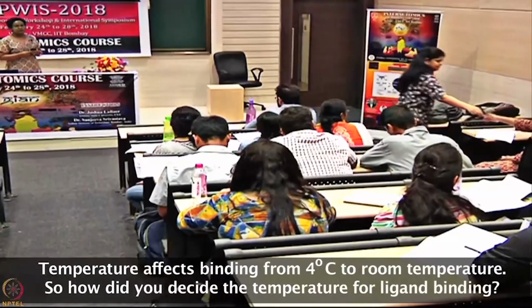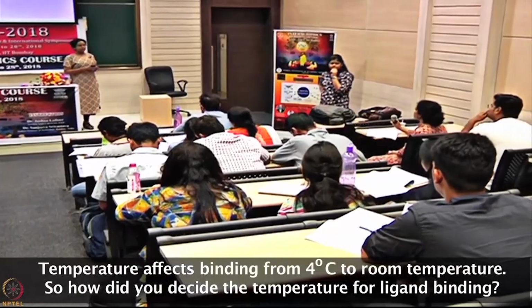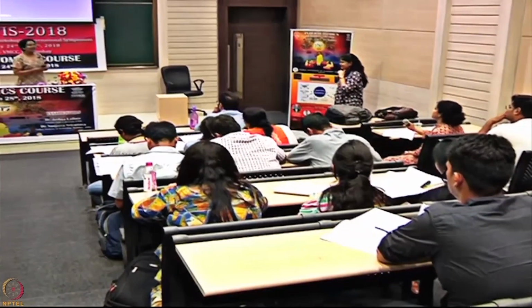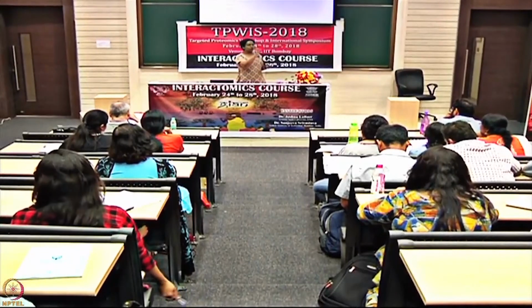Temperature at which it can be done, from plus 4 degrees centigrade. Yes. So how do you decide that temperature parameter? So, typically when you look at the papers that are published, you do it at room temperature.